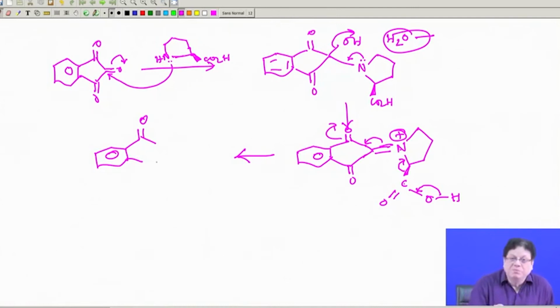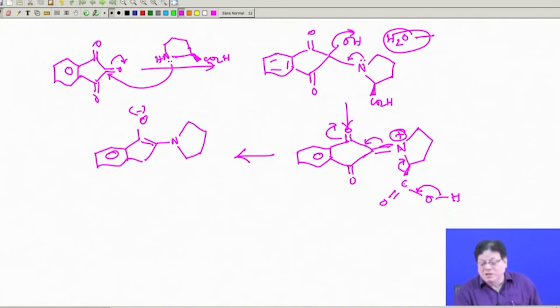So, now the proline has just become a pyrrolidine, a 5-membered heterocyclic nitrogen is what is called a pyrrolidine. So, it becomes a pyrrolidine, and you have an intermediate like this, O minus, and that is the pyrrolidine. So, you see the stereochemistry does not matter, because all these ninhydrin reactions are associated with liberation of carbon dioxide, destroying the stereochemistry of the stereogenic center.